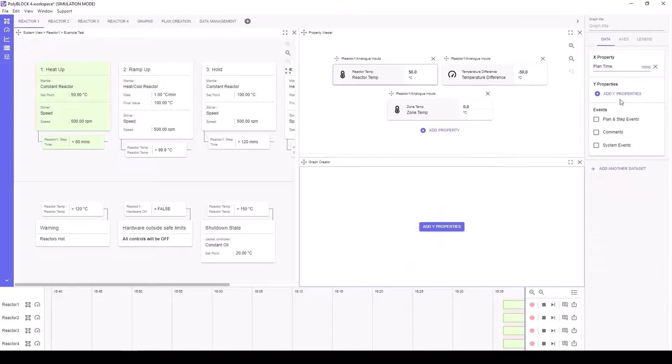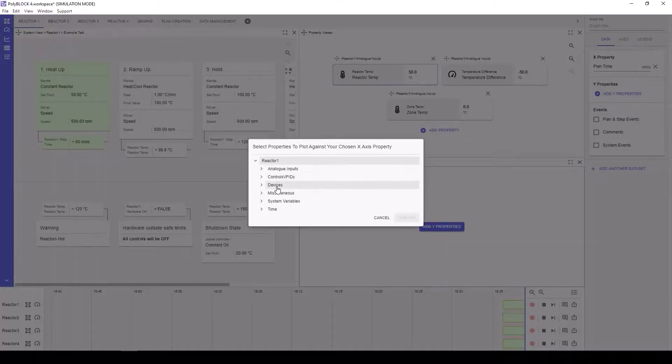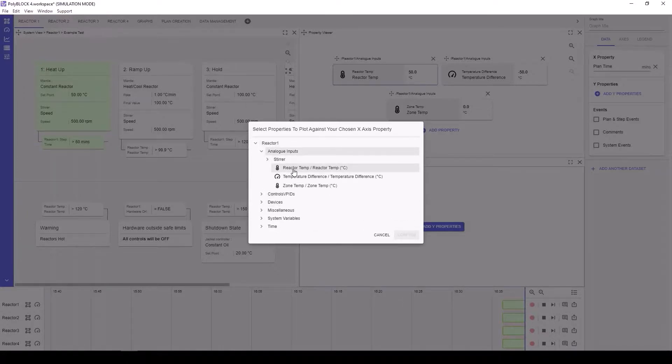You'll see that as we're plotting against a time variable from reactor 1, only other reactor 1 parameters can be plotted for this dataset.